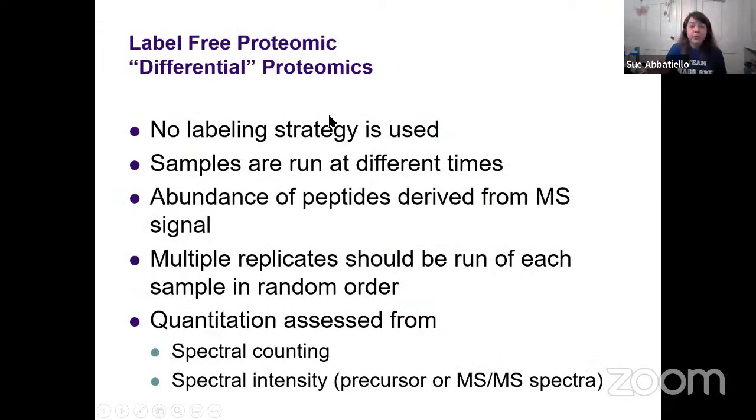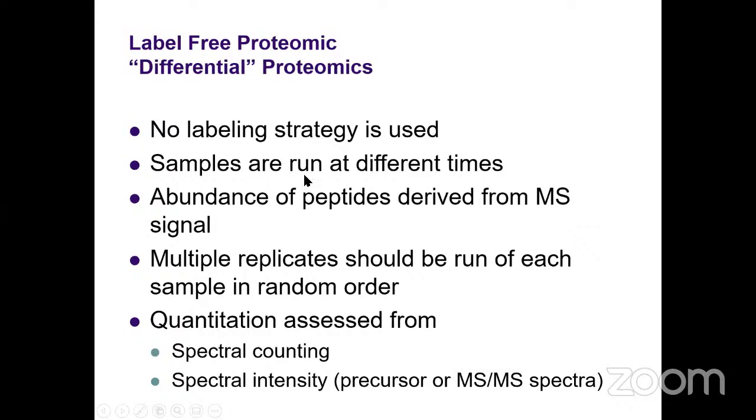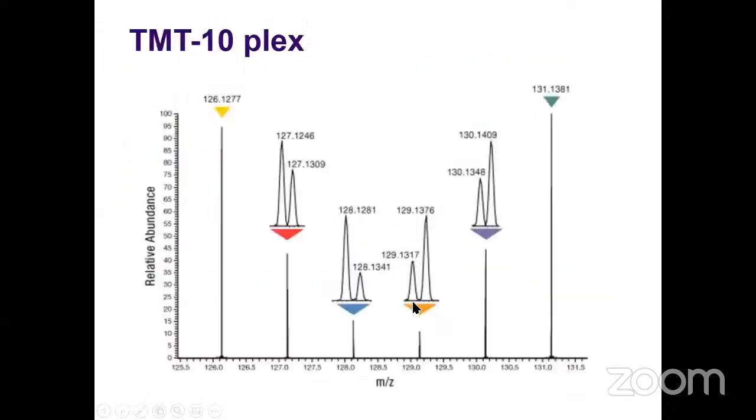Okay, so the last more. Oh, yeah, sorry. A couple of questions in the chat regarding labeling. A question about iTRAQ: what is the point of making isobars? Why do isobars elute at the same retention time?